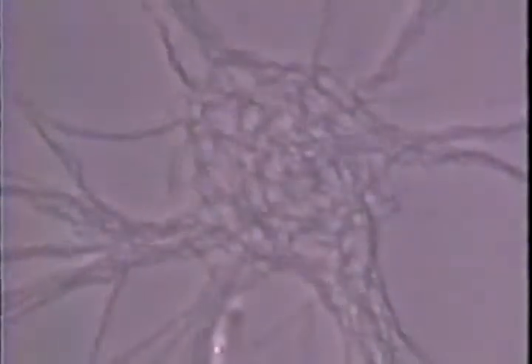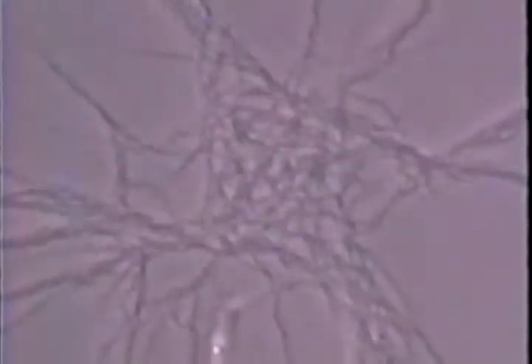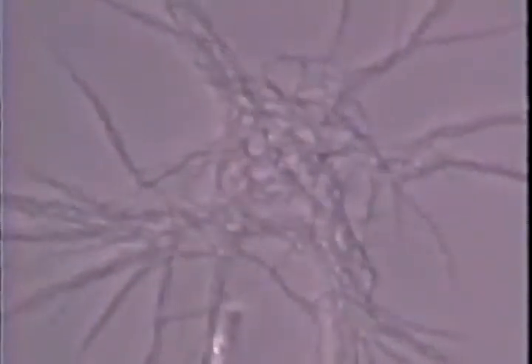A cluster of Borrelia burgdorferi spirochetes from culture by phase contrast microscopy. The same culture cluster in higher power showing the intertwined spirochetes.